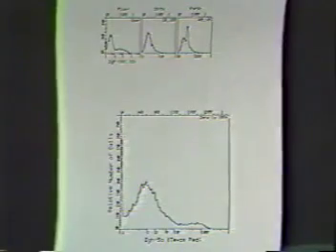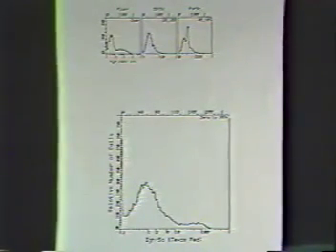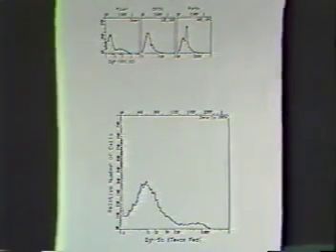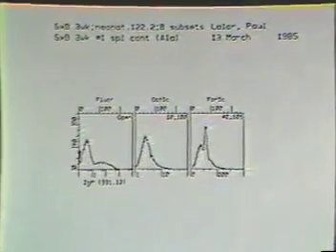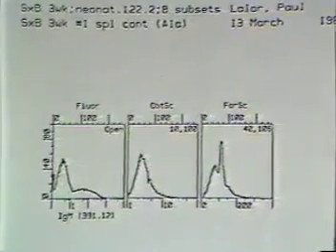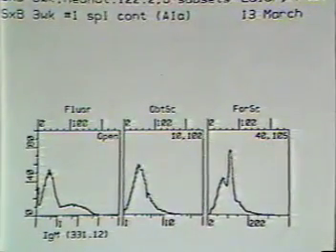In addition to the requested curve, miniature histograms for each of the other parameters appear on the top half of the page. The numbers which appear in the upper corner of a miniature histogram indicate the gating restrictions used on the channel when generating the main curve on the page.